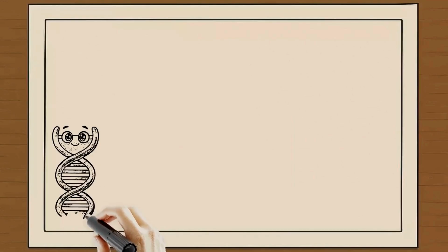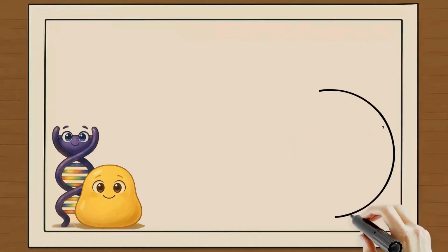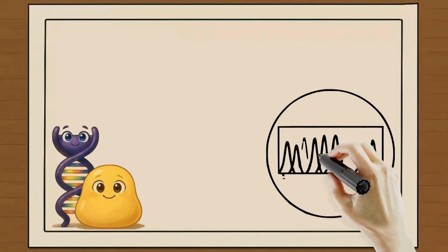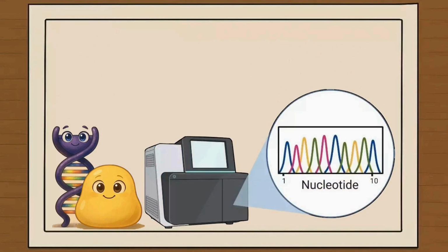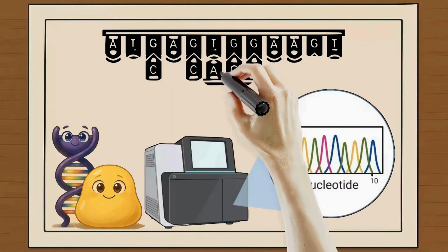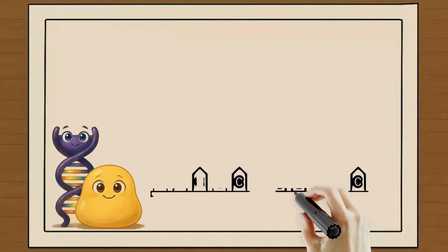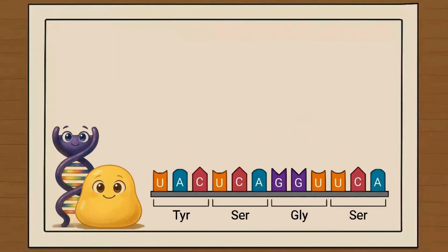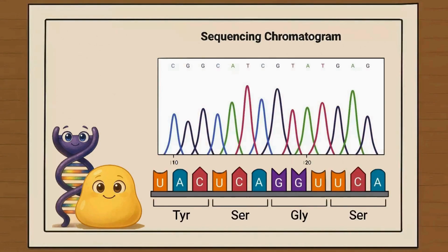And we're back. At its core, DNA sequencing is the process of determining the precise order of nucleotides within a DNA molecule. Think of it as reading the instruction manual for an organism. This fundamental technique allows us to understand the genetic code for research, diagnostics, and even personalized medicine. It's the ultimate tool for confirming the genetic identity of our cloned genes, a topic we covered in a previous episode. The process has evolved dramatically over time, starting from manual, low-throughput approaches to today's highly automated, high-throughput technologies.